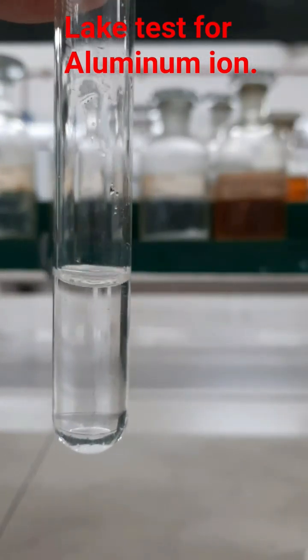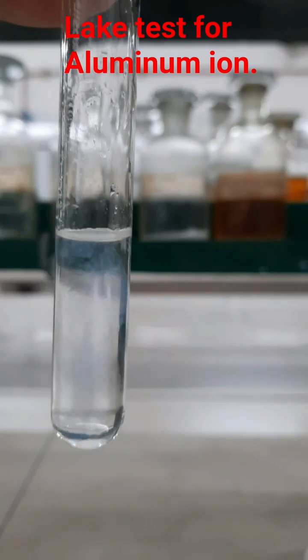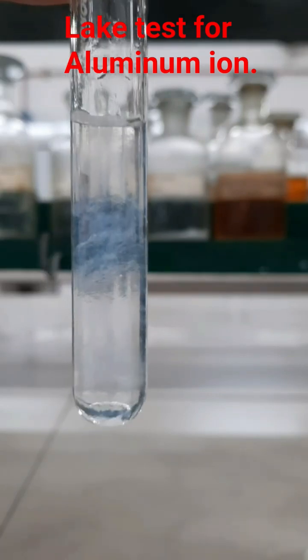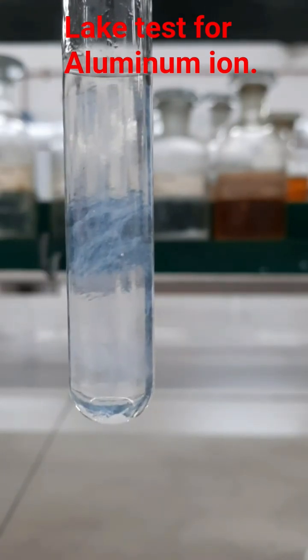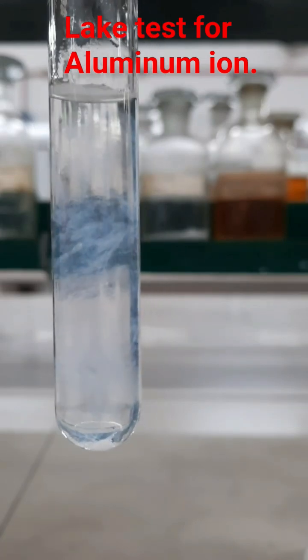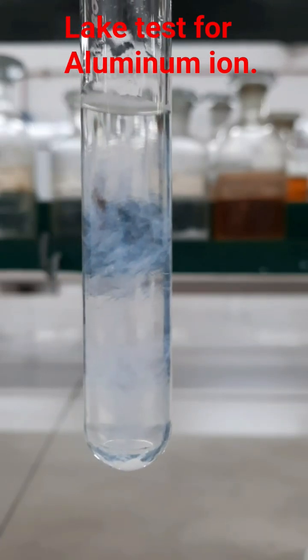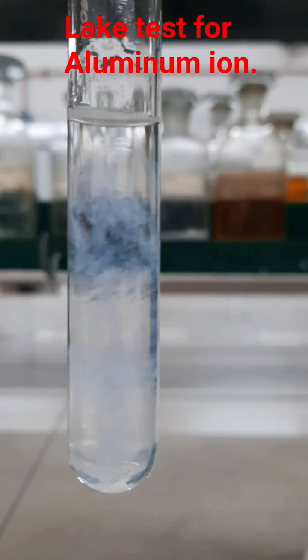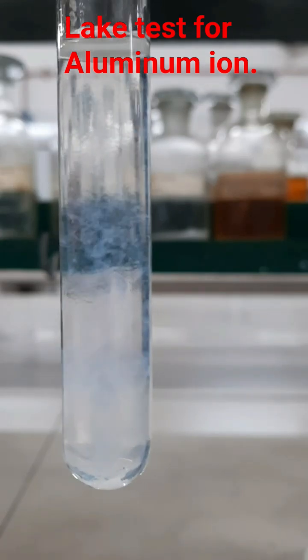After adding this ammonium hydroxide solution, you can see the appearance of gelatinous white precipitate. This will confirm the presence of third group cation and Al3+ ion may be present. Now you have to dissolve this precipitate with the help of dilute HCl.